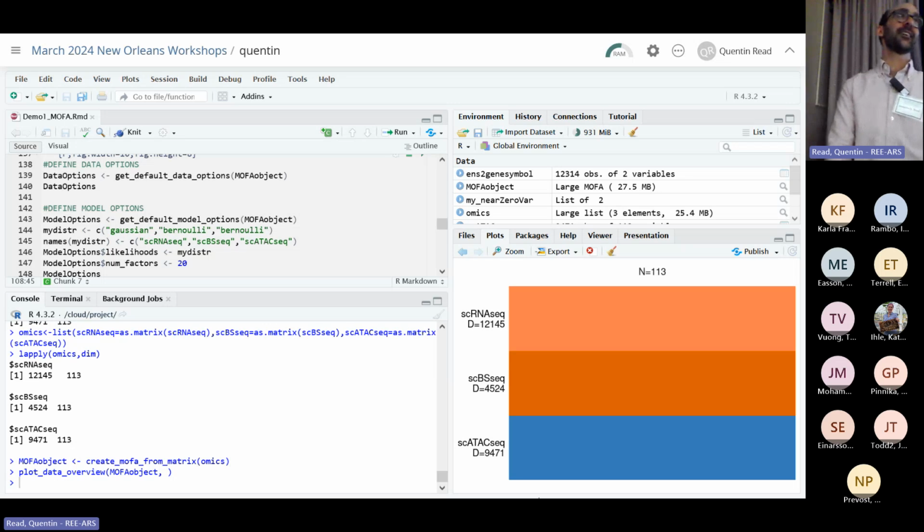You'd have to go look at the paper. I'm not 100% sure whether they come from actual different mice or if it's all from the same mouse in different cells. I think they might even come from the same individual mouse. They are 113 different cells; they took some cells from the stem cells and some from floating embryonic bodies. So there's kind of 2 groups of cells that we're looking at how the gene expression differs among them. That's basically what we're doing.